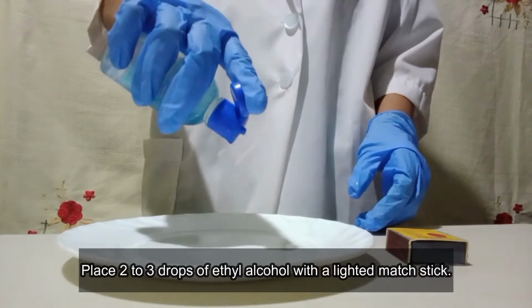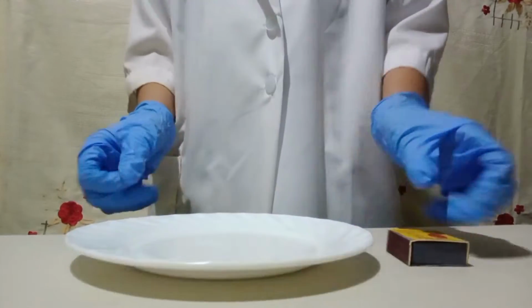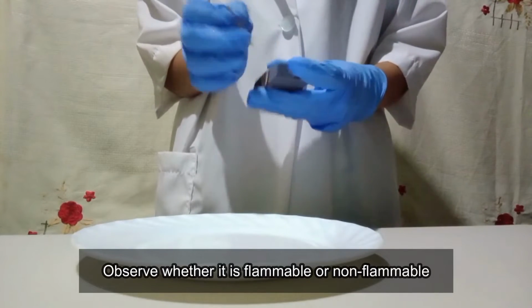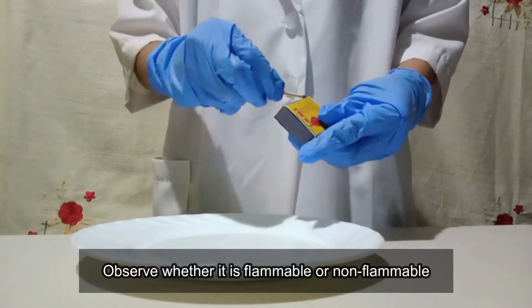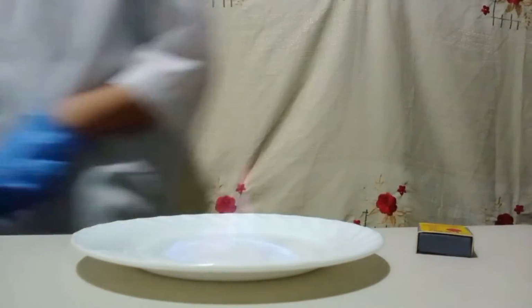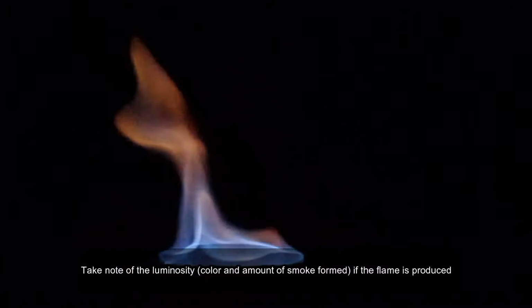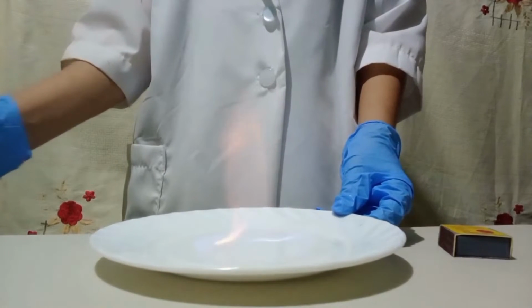Place 2 to 3 drops of ethyl alcohol. Then, touch the ethyl alcohol with a lighted matchstick, and observe whether it is flammable or non-flammable. Take note of the luminosity, color, and amount of smoke formed if a flame is produced.